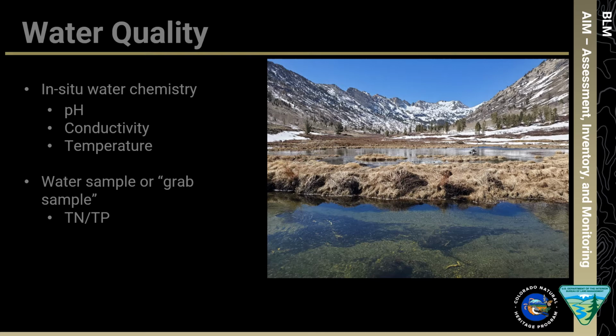Measurements of pH, specific conductance, and temperature can include measurements of both surface and groundwater, and can be taken from multiple locations within the monitoring plot, including from within the soil pit, within flowing channels, and in standing or sluggish surface water.